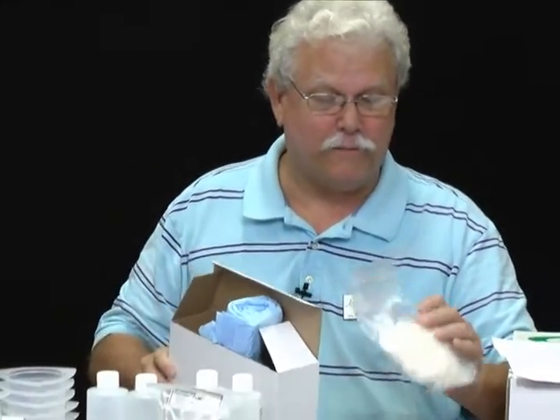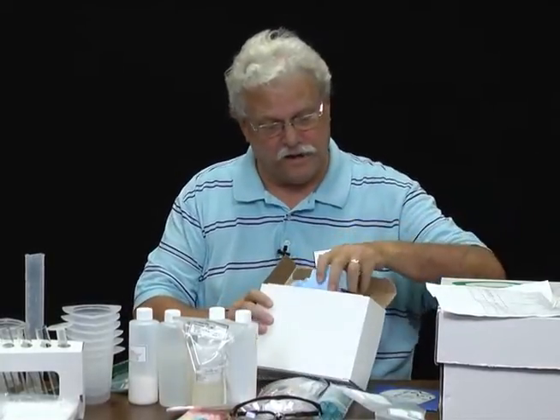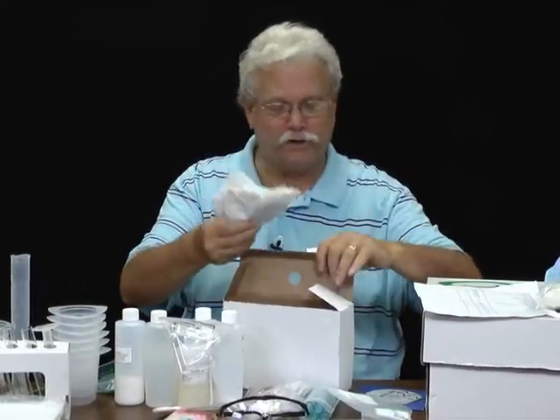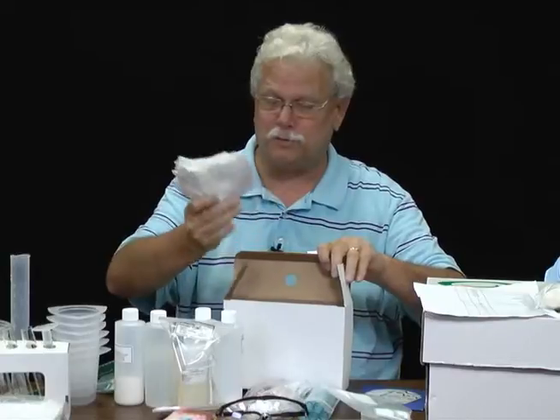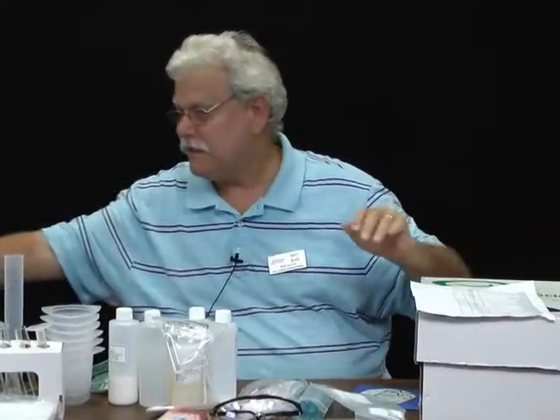Here's an example of some of the items that come with your lab kit. I've opened this one box, and I see that there's a box of gloves, and these are absorbent pads that you could use. Probably an apron. This is an apron that you can wear. So for the large part, these are disposable. Some of these items you can keep, but you could check these off of your lab kit item list.